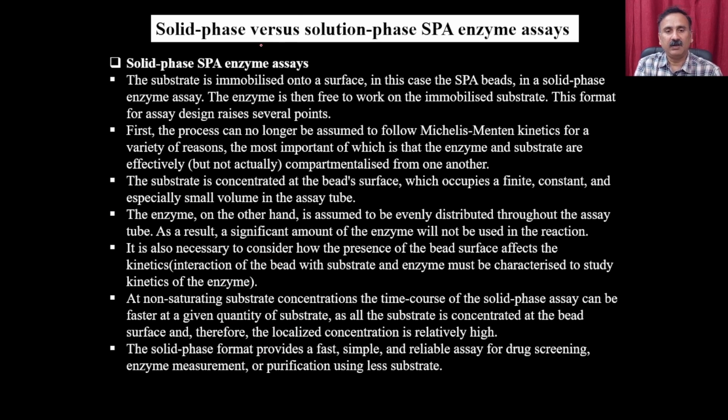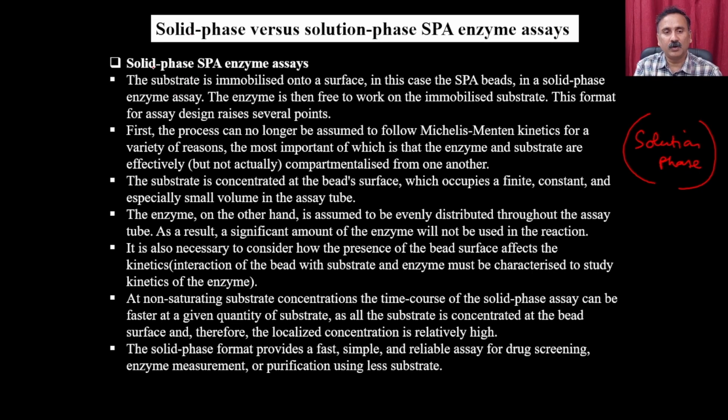Then we have the solid phase versus solution phase SPA enzyme assays. So far, we were discussing the solution phase SPA assays, where you are adding the SPA beads, and that's how you collect the signal from the SPA beads and convert that into the concentration of the substrate or the product. But we can also use the solid phase SPA enzyme assays.